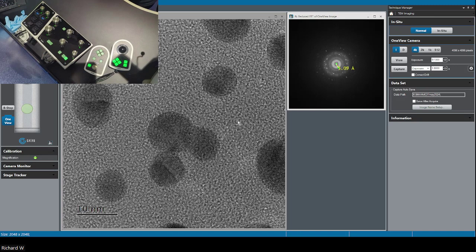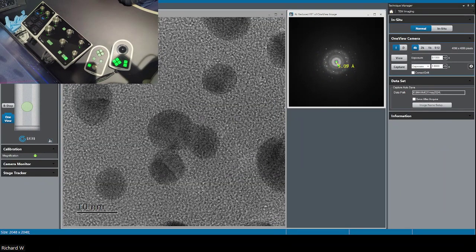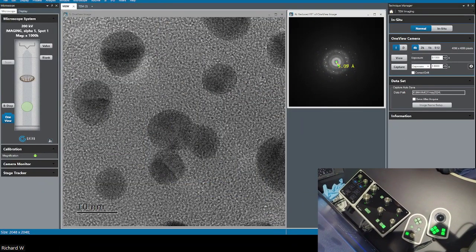Generally speaking, there will be some region of amorphous material you can use for the alignment. It just might not be ideal. So just bear that in mind. So if we go back to the, sorry, did anyone have any questions before I begin this second part?